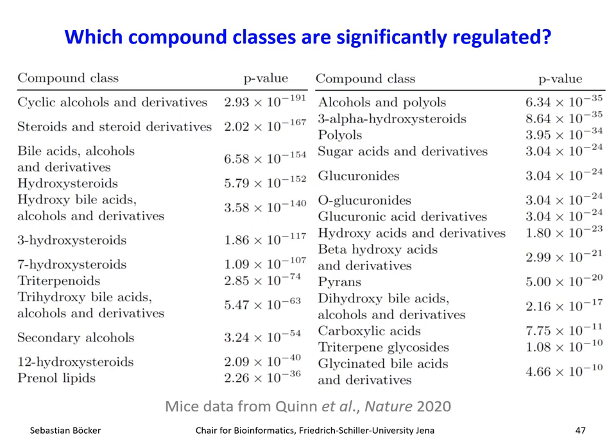And the nice thing is that we don't have to restrict our analysis here to any pathways. I mean, for all of these compounds, probably they are not even contained in any structure database. How can we possibly put them into any pathway? We have no clue about the pathways. But the compound class, we can assign. And then we see that, for example, cyclic alcohols and derivatives are very significantly up or down regulated. You can look through this list and see if some of these compound classes might be so interesting that you want to dig a little bit deeper and see what that actually means.